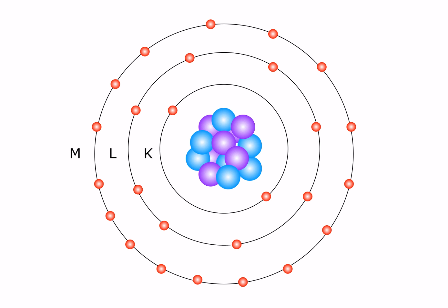These electrons, negatively charged, surround a nucleus, which has both protons and neutrons. Protons have a positive charge, neutrons have no charge. They're pretty much irrelevant when it comes to X-ray fluorescence. Now, the proton exerts a positive attractive force, and this is greatly attractive to all the electrons around the atom, but they can't quite get into that nucleus for a variety of reasons, typically known as the strong and weak nuclear forces.